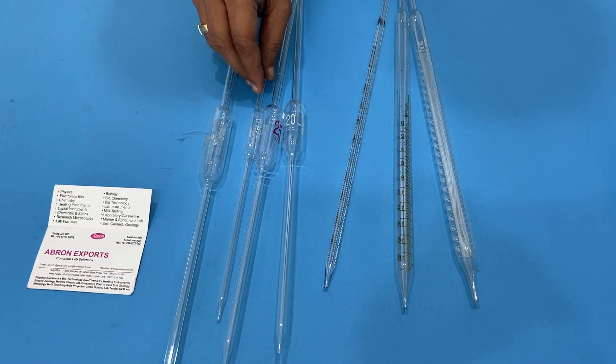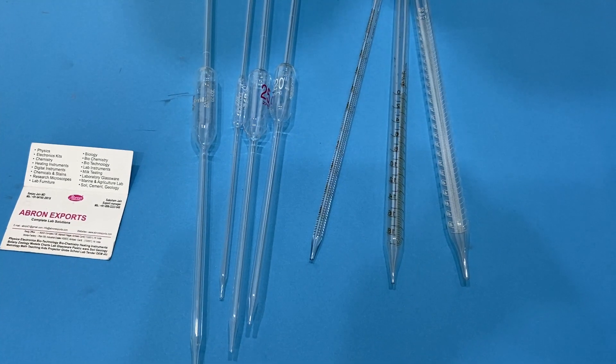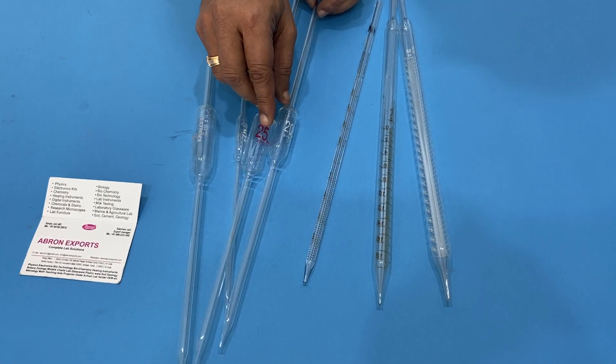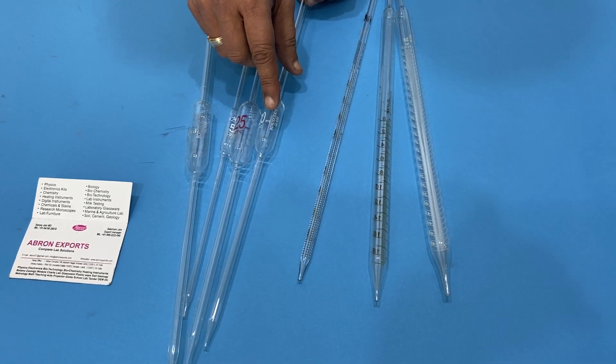This has one bulb inside and it comes in 5ml, 10ml, 15ml, 20ml, and 50ml. Sometimes in white gradation, amber gradation, or no amber lining. These are made from borosilicate glass.